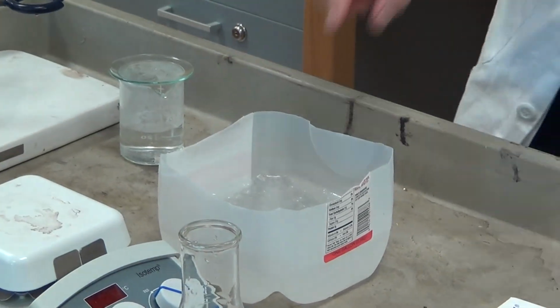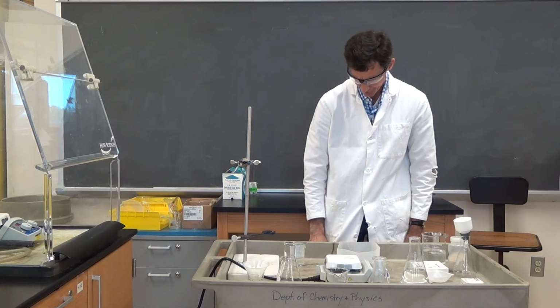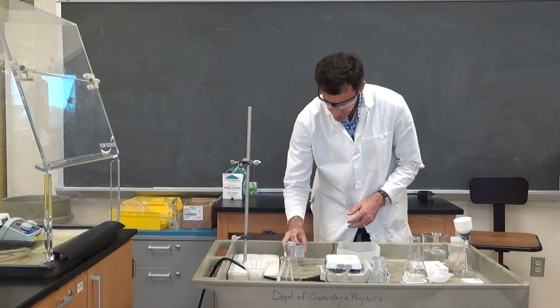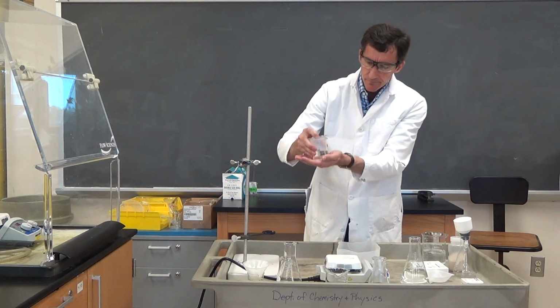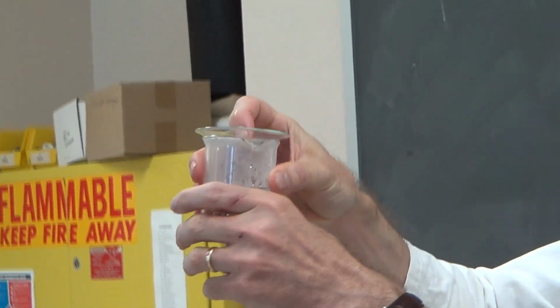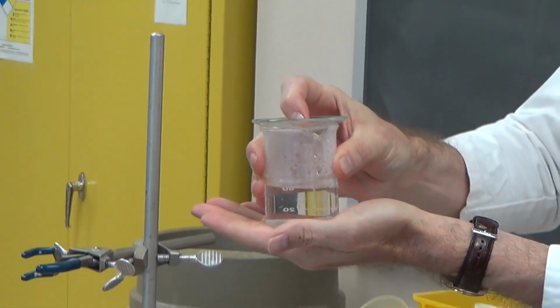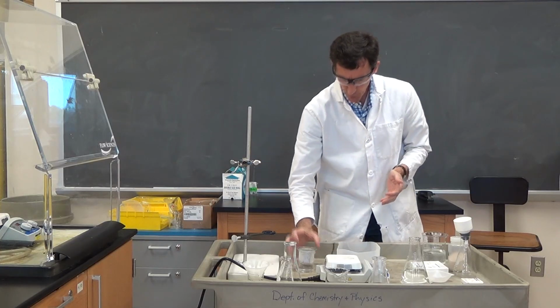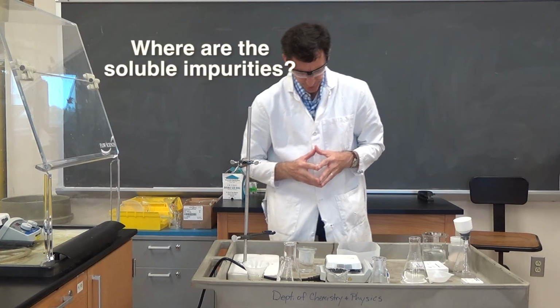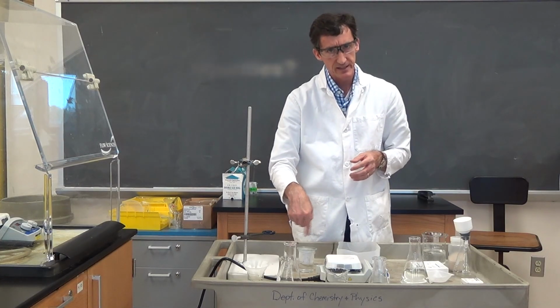Kind of thick, so when we put our beaker in, it won't have a tendency to turn over. There's already solid recrystallizing on the bottom. It's still a little hot. At this point, we can ask, where is our sugar? The sugar should have been dissolved. It should be dissolved in the water.